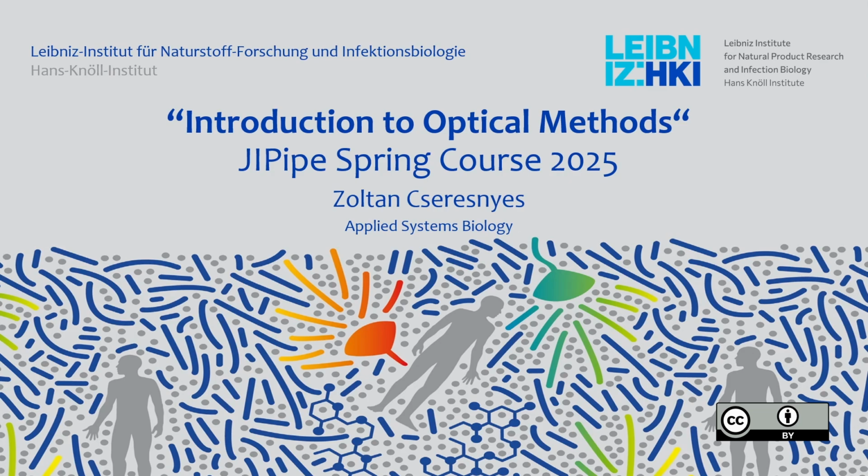And if you don't have the basics of optics and microscopy, then it will be very easy to stray away during your analysis from the biological truth, or chemical or mechanical or material sciences truth, because you don't know what you're looking at and you don't know what you can expect from a device that generates images. Because of that, we have the first morning always dedicated to microscopy, and I will talk about that.